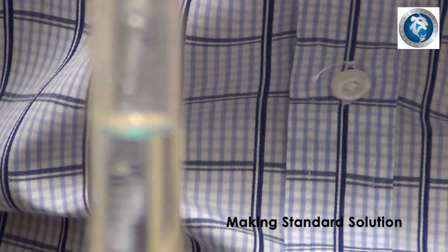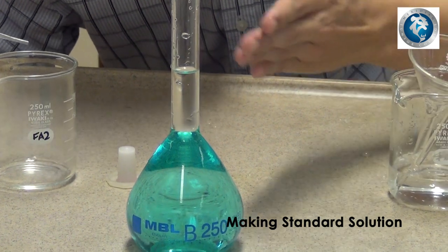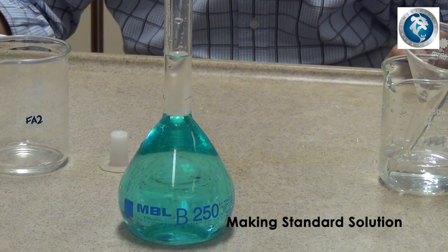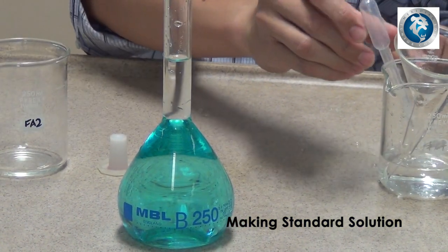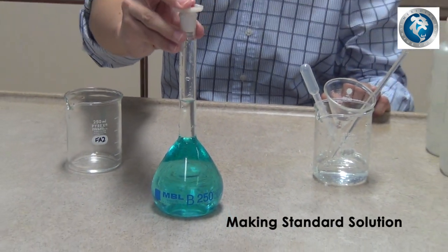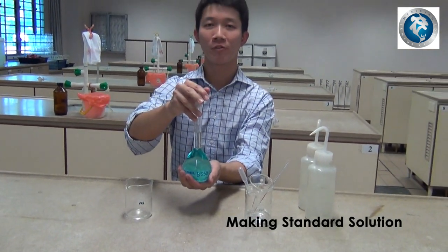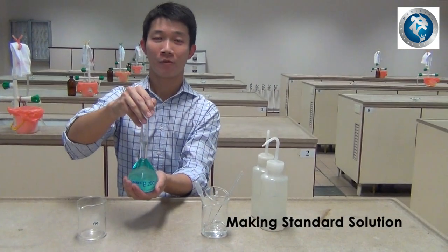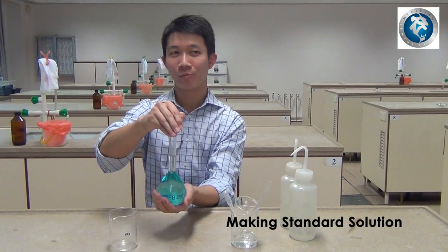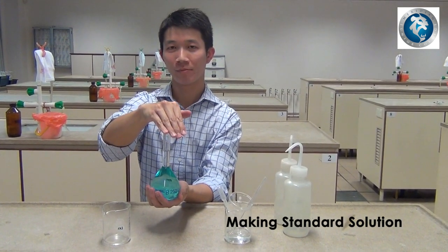Bring yourself down to eye level to check that the bottom of the meniscus has touched the graduated mark. Once that is done, cap the volumetric flask and proceed to shake the volumetric flask for five to ten times, putting your hand on the cap, making sure that the cap does not fall off.